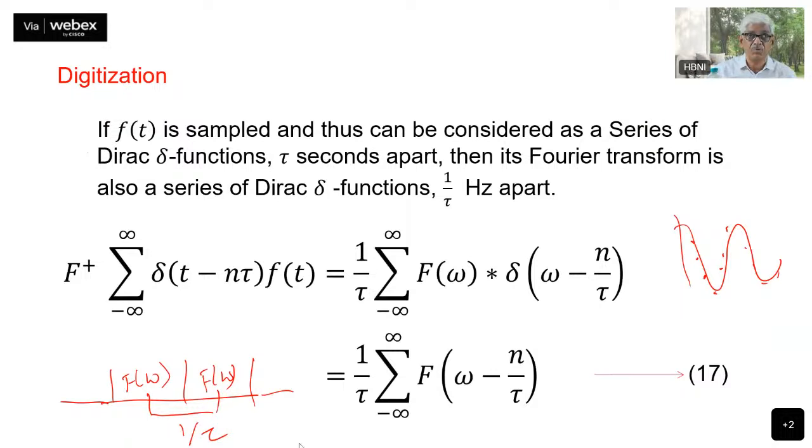And this becomes important. Why am I showing you this? This becomes important to understand the folding of the signals, also called aliasing. The folding of the signals happens because of the theorem. If you don't set your offsets properly, if you don't set your spectral widths properly, then your signals will get folded, and that happens because of this. To understand that, you need to understand this theorem. This is the theorem of digitization.